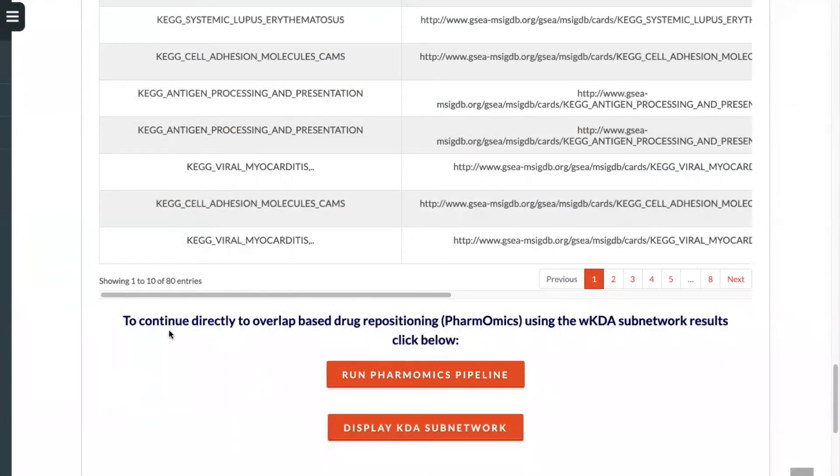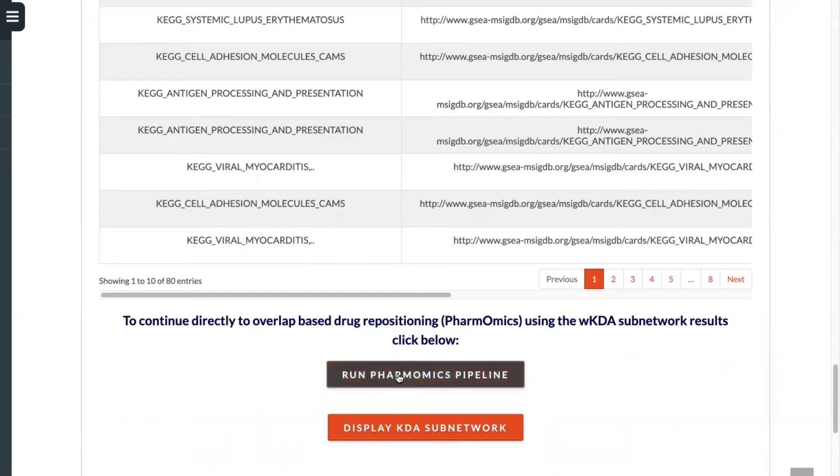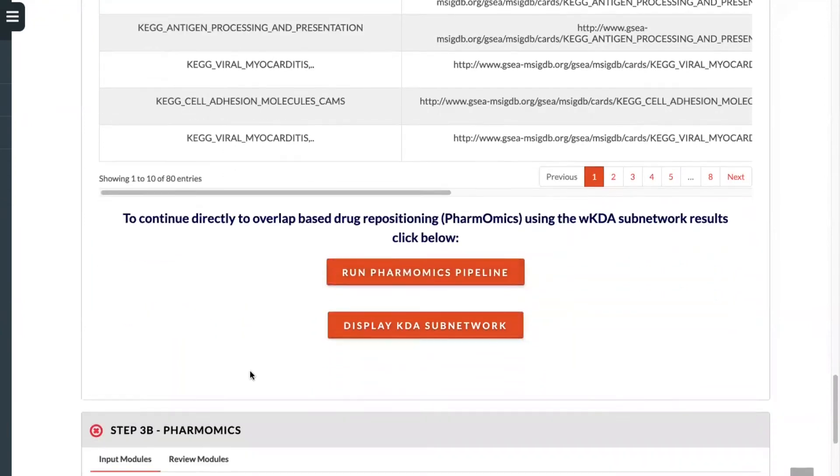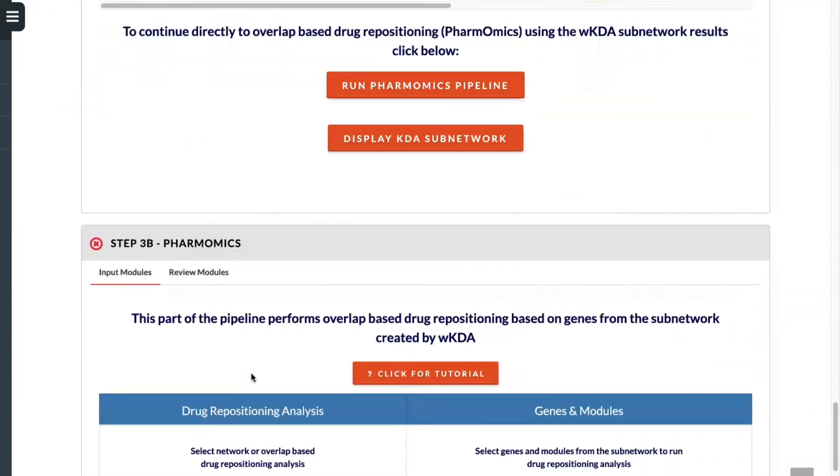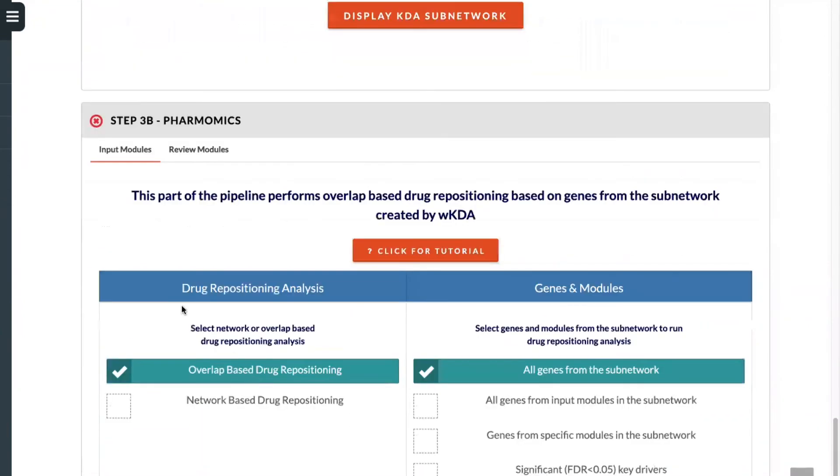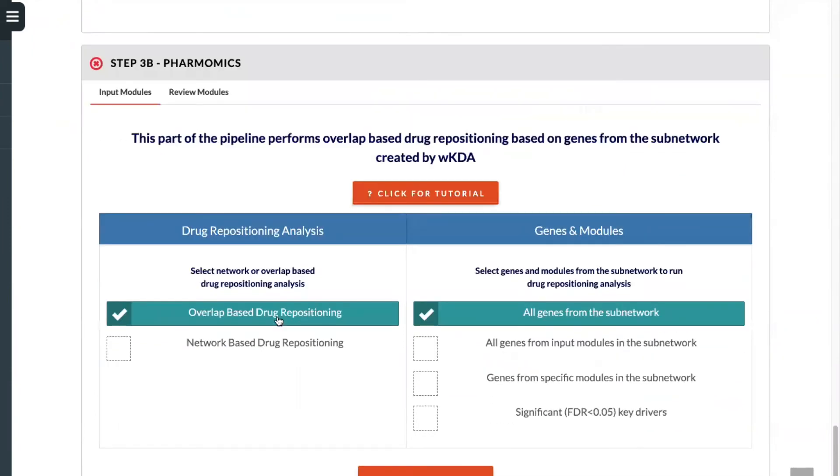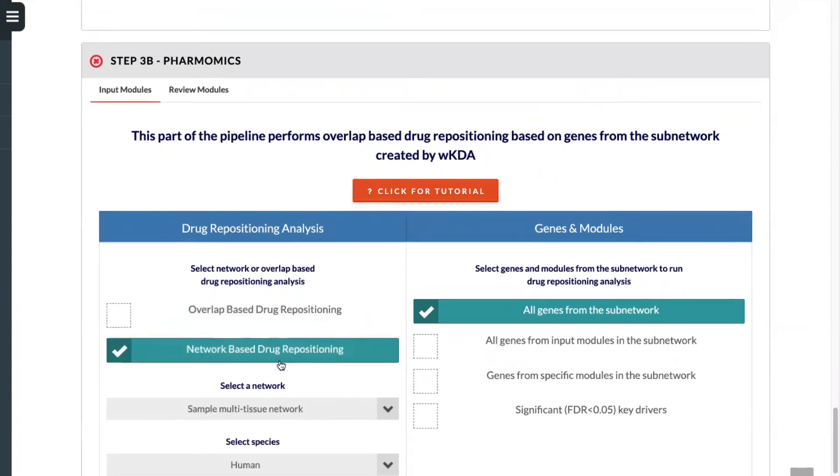Upon completion of the key driver analysis last time, we chose to display the key driver sub-network. In this example, we will go through inputting the key driver results into PharmaMix. To do this, you will select this button. Upon selecting this button, you'll be led to step 3b PharmaMix, where you'll have the choice between selecting overlap-based drug repositioning or network-based drug repositioning. We will select network-based drug repositioning.